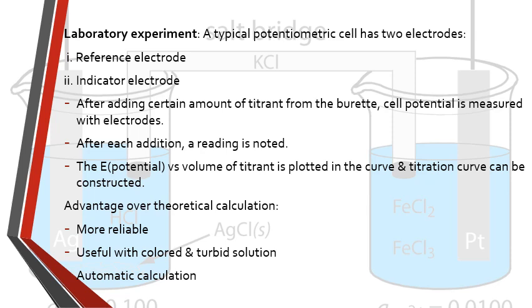Continue adding the titrant until the reaction is complete, which typically means the potential no longer changes significantly with addition of the titrant. There is no significant change of potential when you add the titrant.